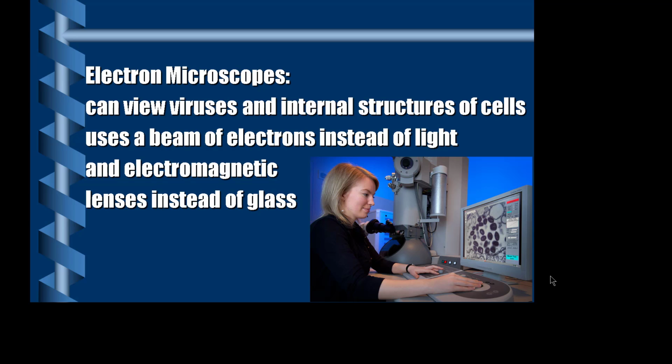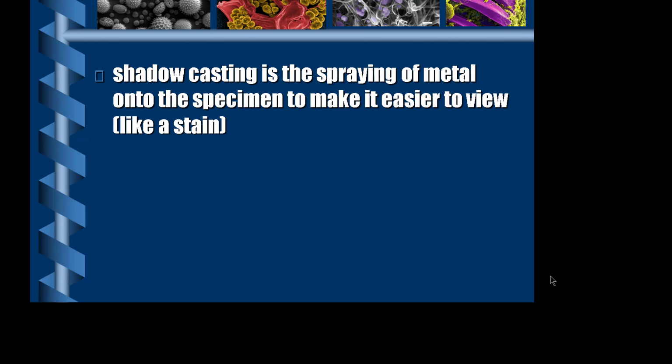Okay, hopefully that was enough time to write. I'm going to switch the slide. So the special preparation I was talking about, at least one of those is called shadow casting. I'm going to let you write and then I'll explain it.